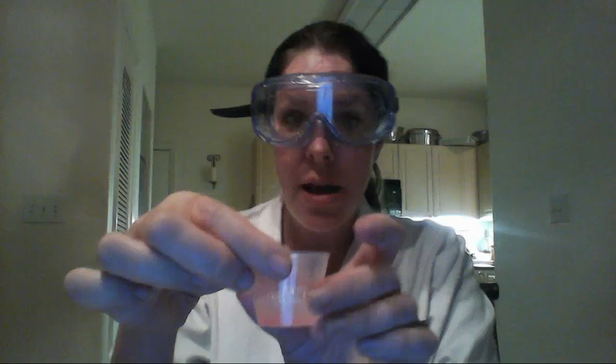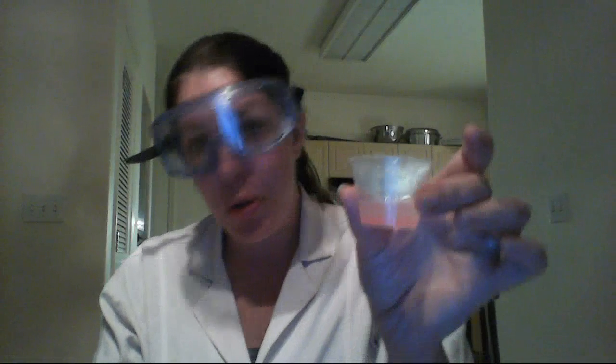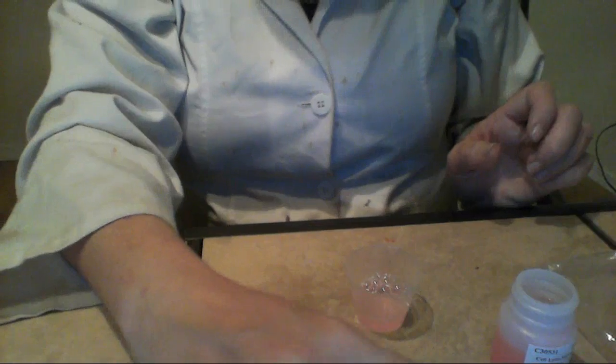Now you're going to want to let this sit at the table for 2 minutes. That gives time for the lysis buffer to dissolve the membranes, the outer membrane and the nuclear membrane of the cells. So I'm just going to set this down on the table for 2 minutes. Okay, so I'm going to pause that and I will be right back after 2 minutes.